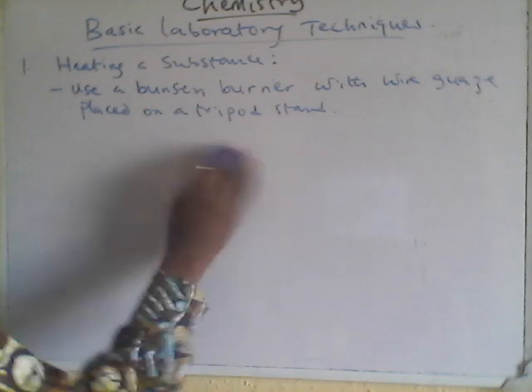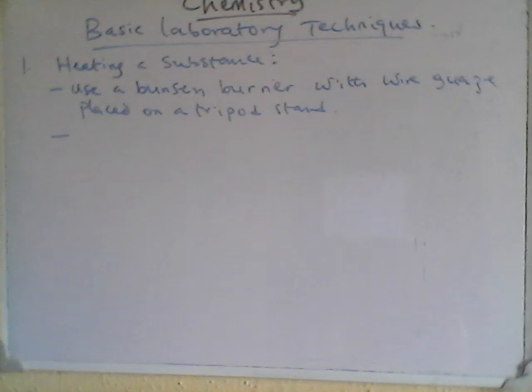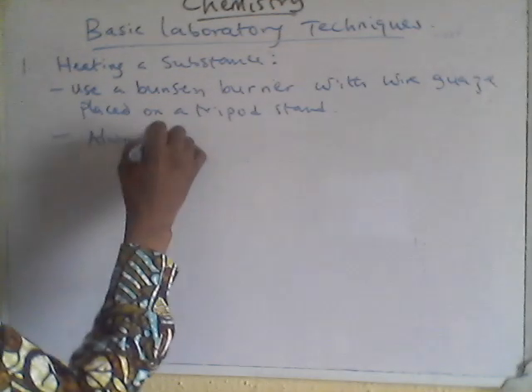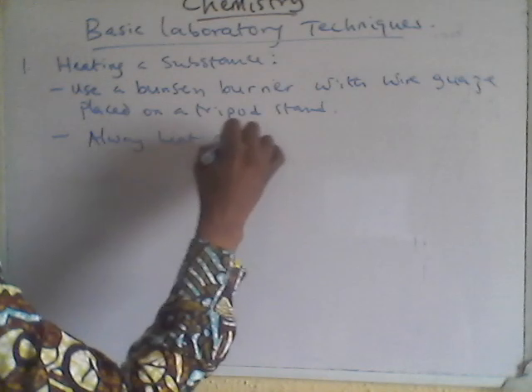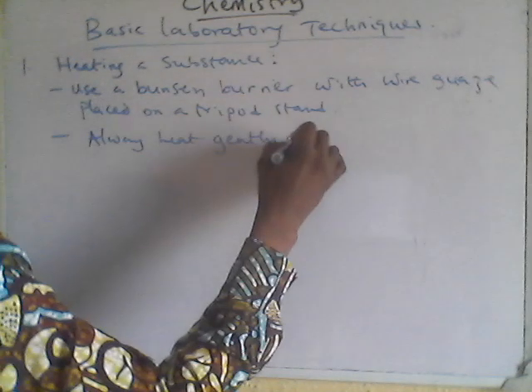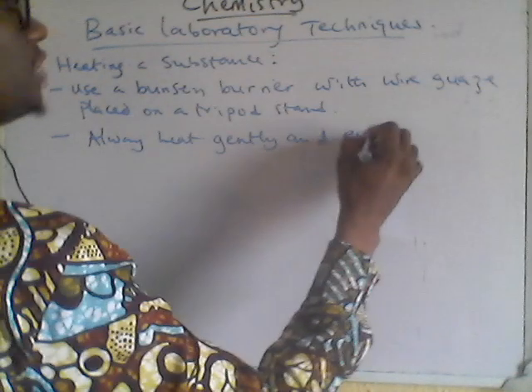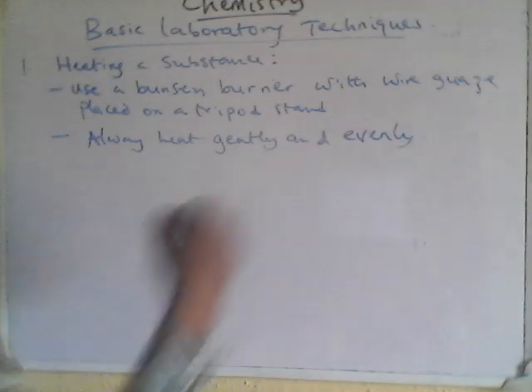Secondly, always heat gently and steadily. Don't rush. Don't give it a high heat because you want to finish on time.